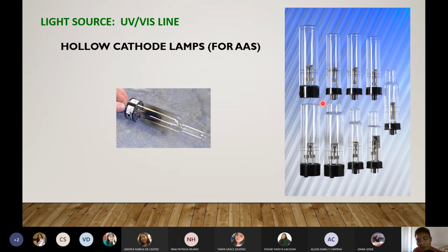Okay, so may HCl for copper. Ibig sabihin copper gas yung nasa loob. Nag-exist ba yon, sir, yung copper as gaseous phase? Yes, no. Pwede mag-exist yung matter as gas phase. So gagawin lang nun is i-compress lang nila yon dito sa tube na to. And once it glows, it will detect the copper, no.